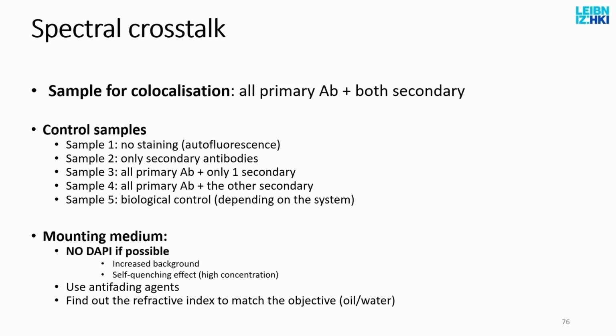So yes, I have a bit more error because of the mismatch at the beginning, but this error is constant throughout. So my image will be homogeneous. A little bit worse, but homogeneous. The other way, it will get much worse as I focus. So if you have a choice, keep this in mind.